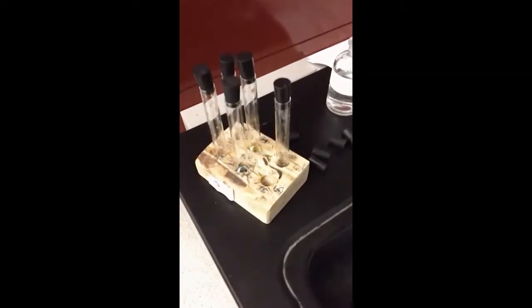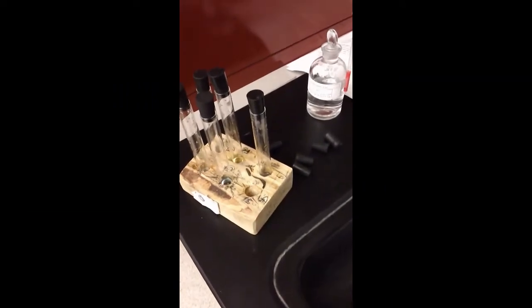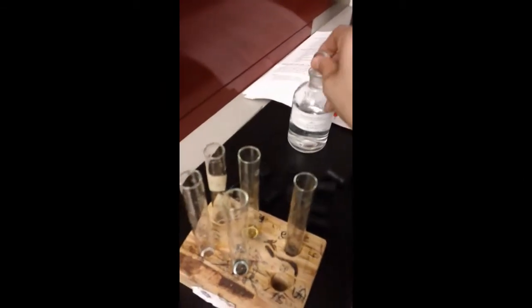All right, welcome back. We have finished test A with our flame test, and now we are in test 2. So I have my new set of chemicals. I have already washed the test A out, and I've gotten a 0.5 milliliter of each of our new chemicals here. Notice how I have them labeled as well. And now what we need to do is we need to add 5 drops of HCl into each of these test tubes. So I'm going to do that now. You want to add 5 drops.